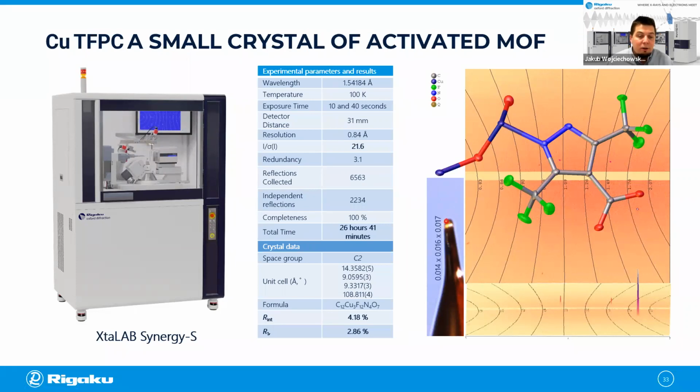And very often, people just go to powders straight away. But with powder structure solution, you don't really have a chance to make sure that the MOF is activated, or see if it's actually fully clean, because the structure solutions are not so reliable for such precision questions.